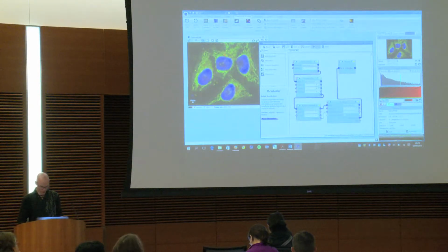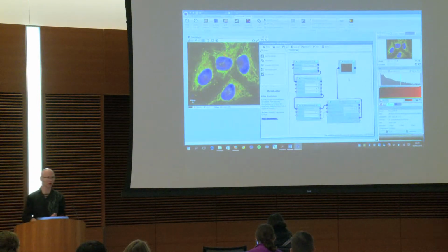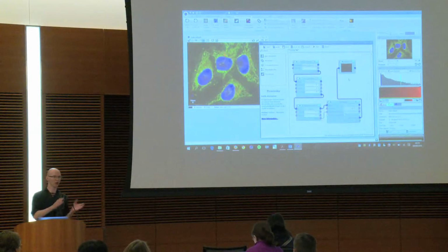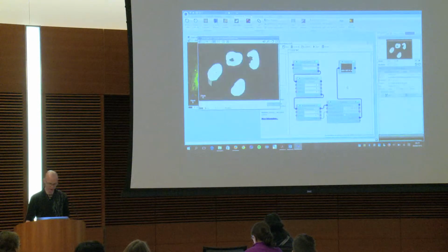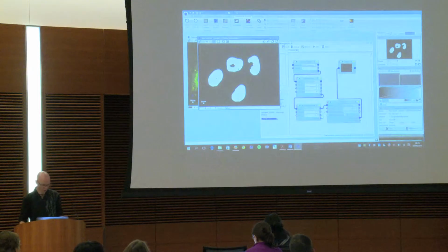So we reset the protocol, execute again, and you can see that the result is all black, but actually it works. It's just that the color map is not redefined, and we have a binary output, so we have only 0 and 1 value in the image. So if you want to see it, we have to double click on it. And this time we have the binary image appearing. Okay? So if you check the value in the image, you can see we have 0 value for the background and 1 for the object.